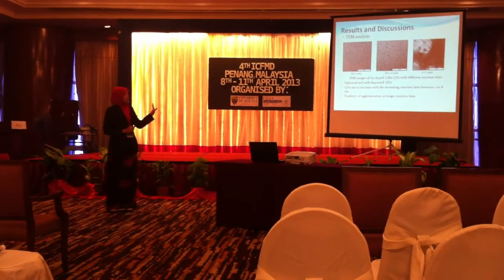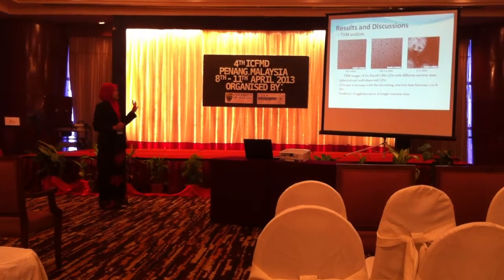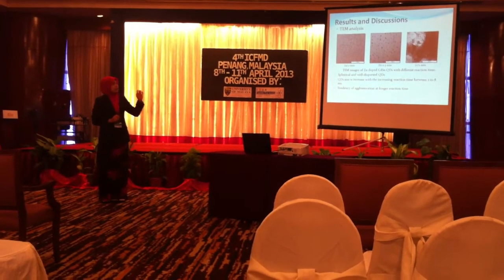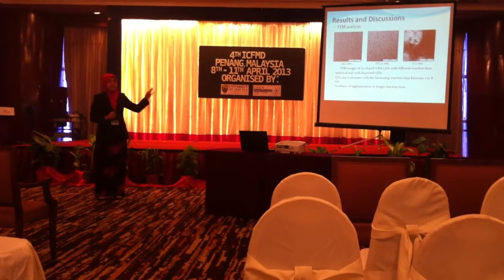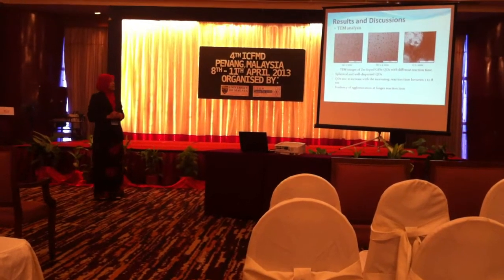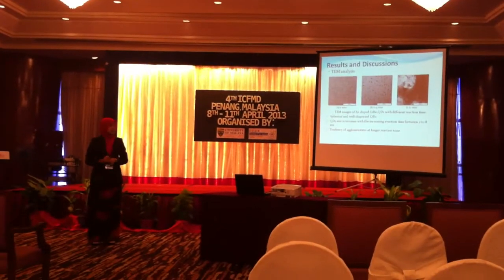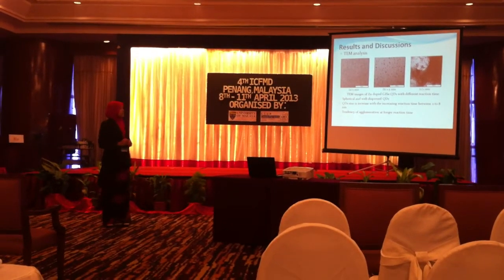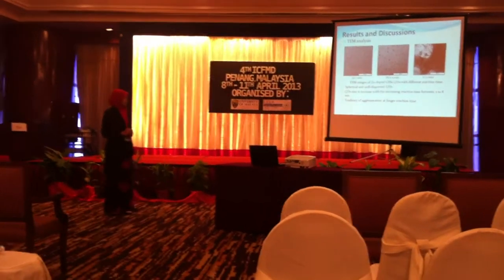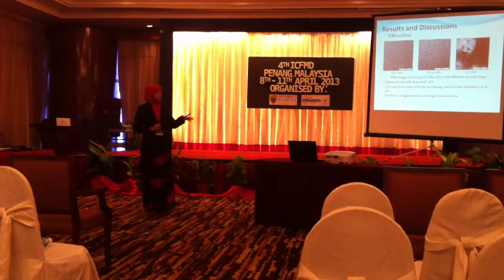From the first one at 0 minute, which is the immediate reaction after I dope zinc, it shows smaller particles, and when the reaction time increases, the size becomes bigger and agglomerates. So here we can clearly see that the particles are spherical and well-dispersed quantum dots. The quantum dot size increases with the increasing reaction time between 2 to 8 nanometer, and the tendency of agglomeration occurs at longer reaction time.